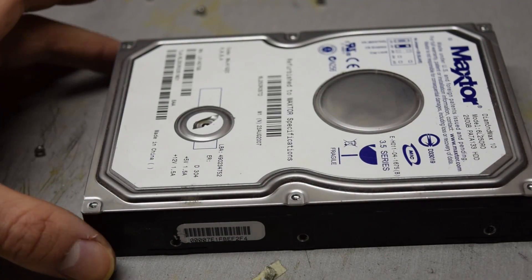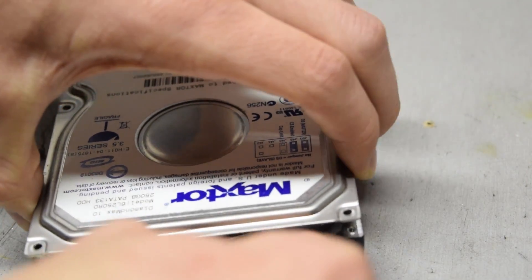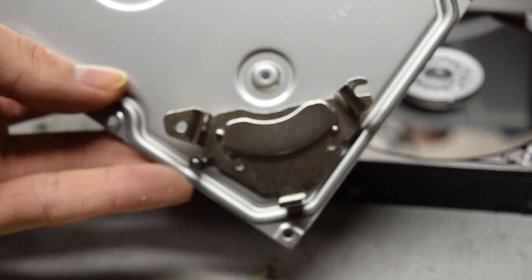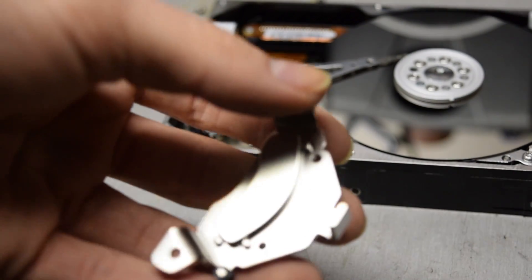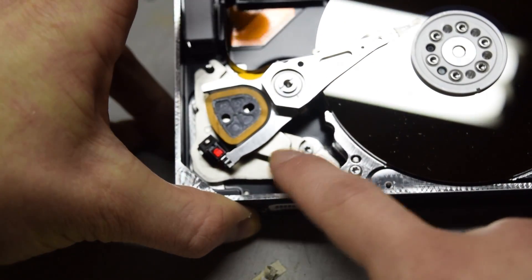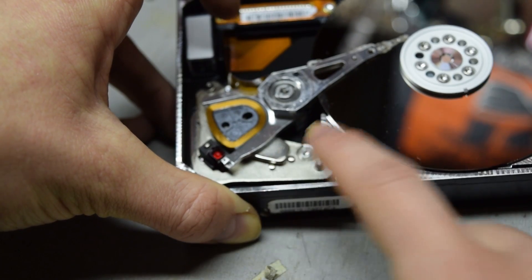Now that all the screws are removed the cover can be pried off. In this hard drive one of the magnets is secured to the lid just with some glue — so there's our first magnet. This project only requires one magnet; depending on the hard drive it's going to be underneath the read-write arm. Right there is the magnet and that can just be removed by unscrewing different parts.